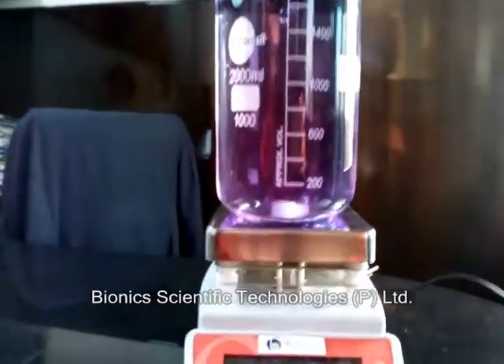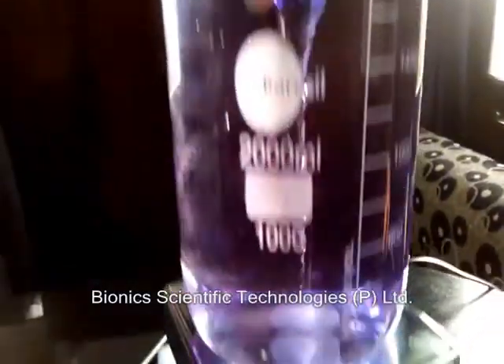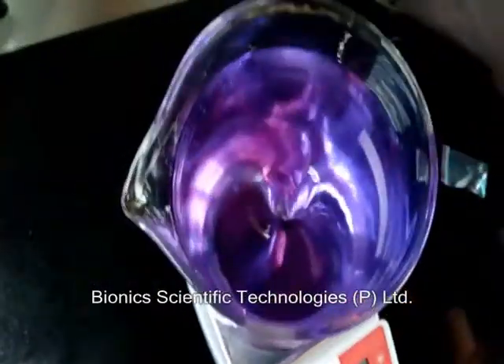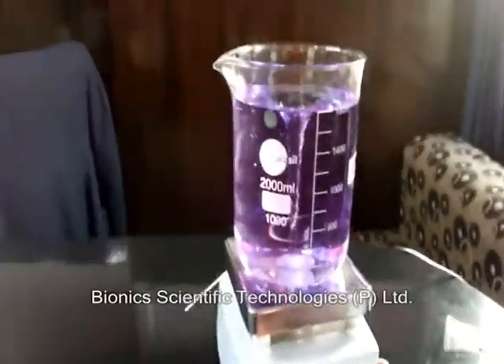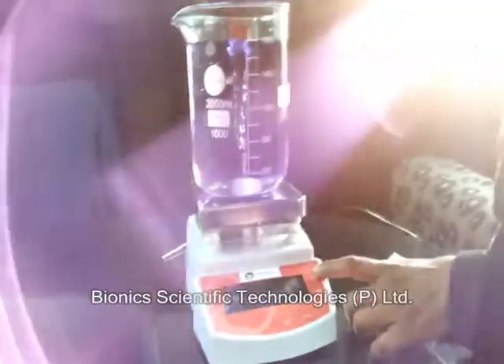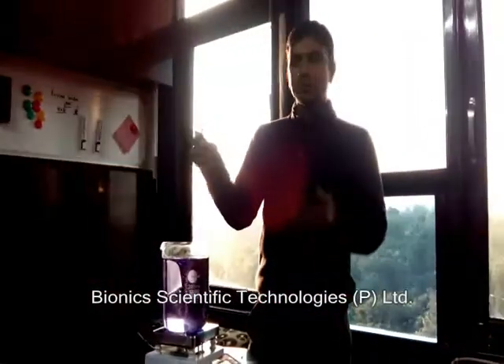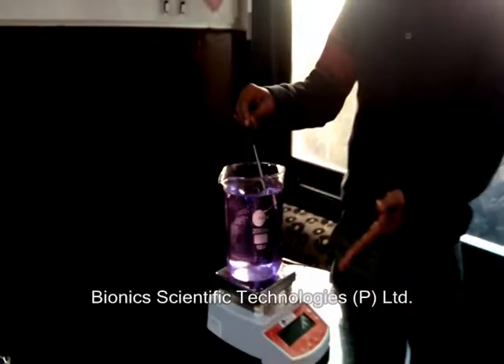This is correct — let's get started. Now we want to test the actual temperature of this solution. We can put this sensor in and it will show you the reading.